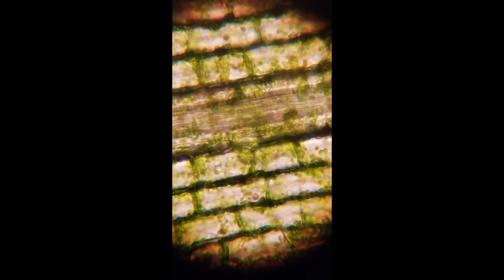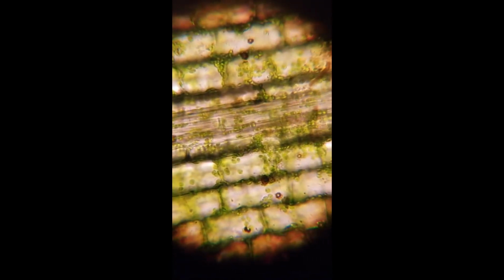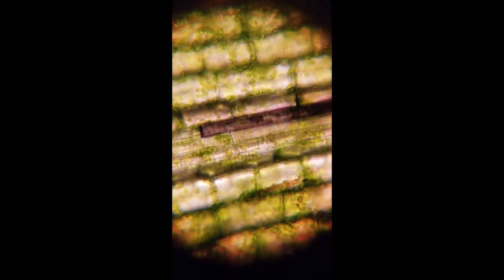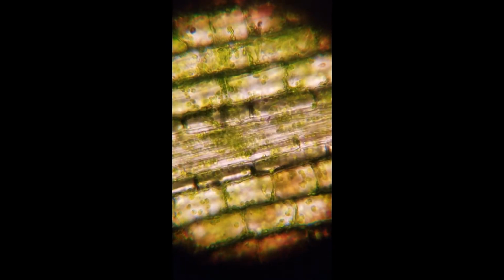So let's take a look to the left inside of the plant. You can see those green chloroplasts moving around. Those organelles are the ones that use the sun's energy to do some chemistry. And if we look at the central stem, the long stem in the middle of this leaf, I see a lot of movement. I see that this plant is transporting things from one place to another. Now maybe that's only because I cut the end off it. That might be the only reason that we see these organelles moving.